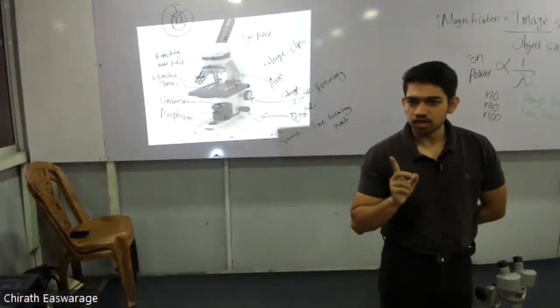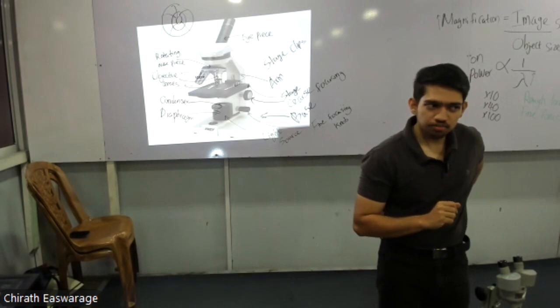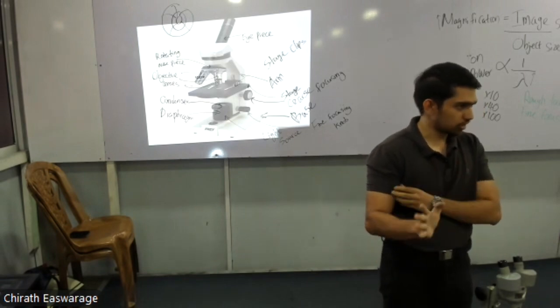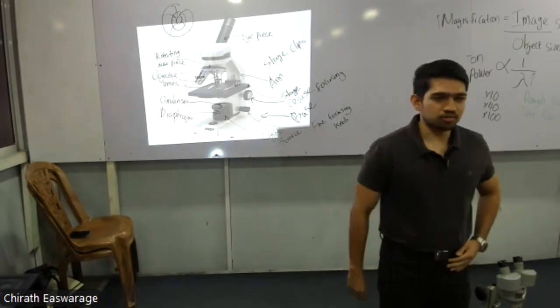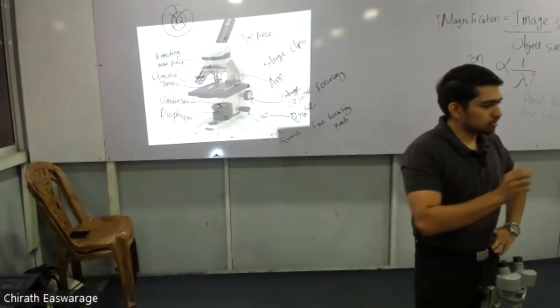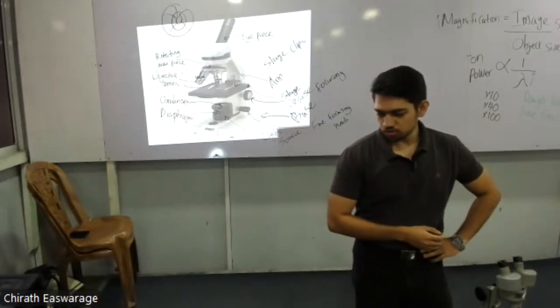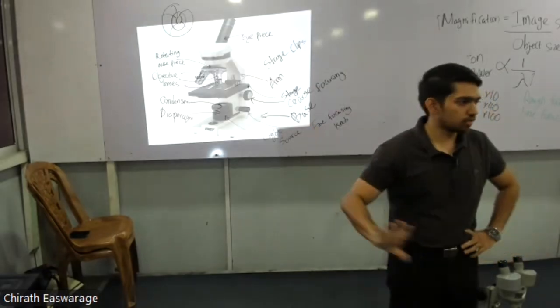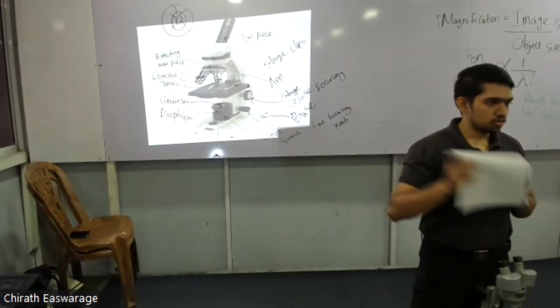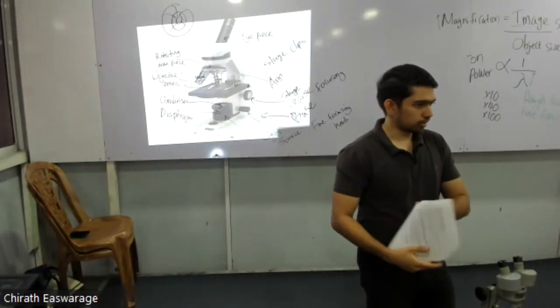So in your practical guide, did you download the practical guide? Right, from the NIE website, you have the practical guide PDF. Okay, A-level practical guide. It's better if you can just have that PDF with you. In there you have a simple line diagram of a light microscope. If you can't draw one by yourself nicely with all the parts, you can copy it. Right. Homework, online students also, in this space, draw a microscope.